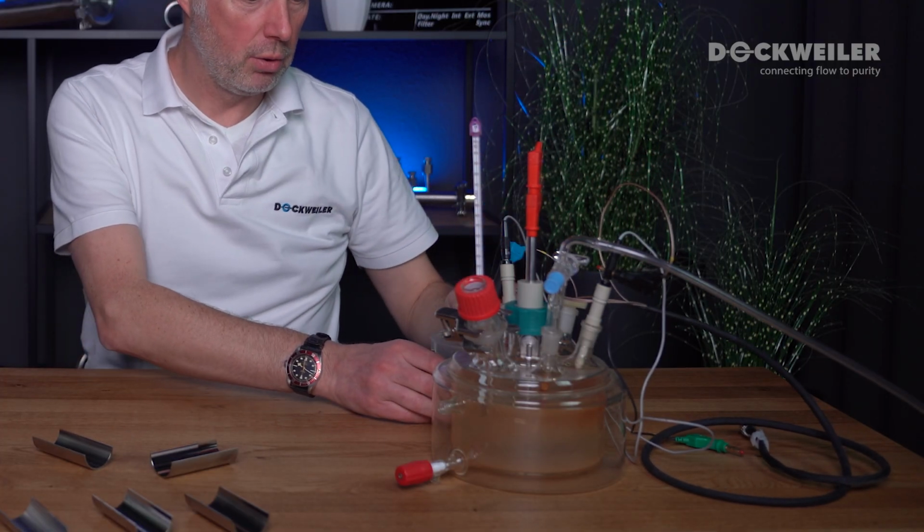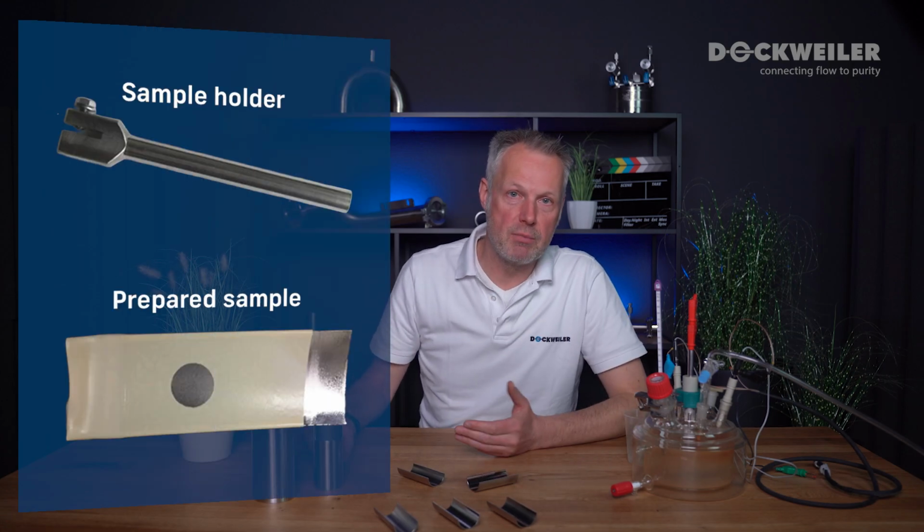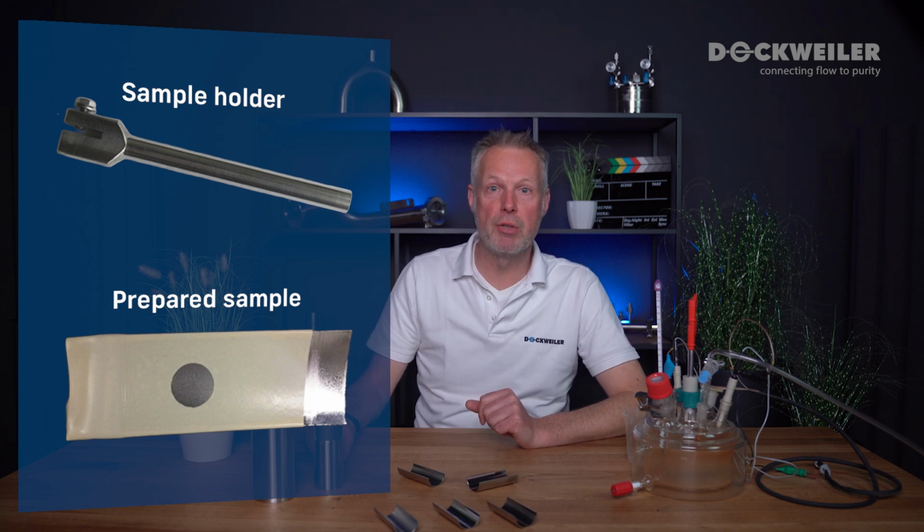What we furthermore do is keep the temperature stable in order to be sure that we don't have any temperature effects in that measurement. And then we continuously increase the potential between the working electrode and the counter electrode, and we measure it with our reference here. So these are the samples as you actually do them with the specific sample holders.